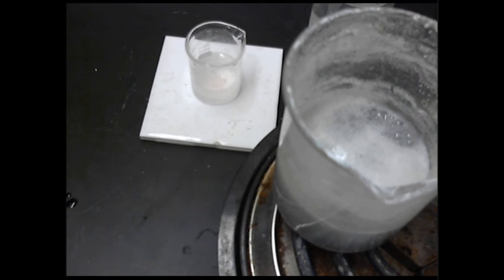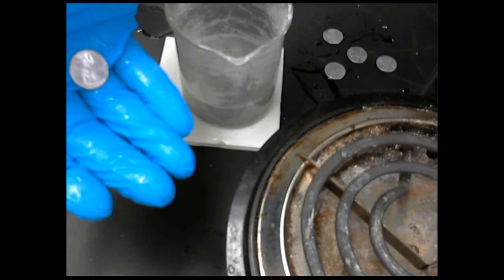Now with other elements on the periodic table, if you boiled them at this temperature, because the temperature is so high and you're adding so much energy, it would force them to react. But because the transition metals are so unreactive, they are able to resist corrosion and chemical reactions, there's not actually a chemical reaction going on here. It's not like the copper on the pennies is wearing away. It's just being plated with zinc. It's still zinc and it's still copper, the same materials that were there before.